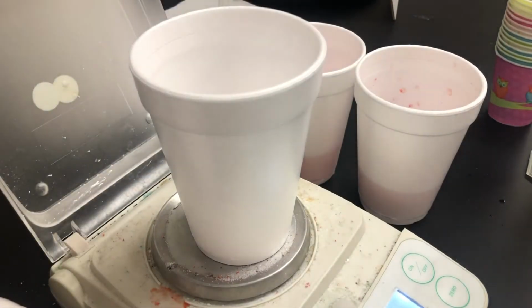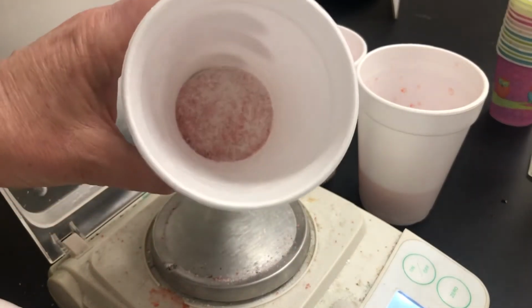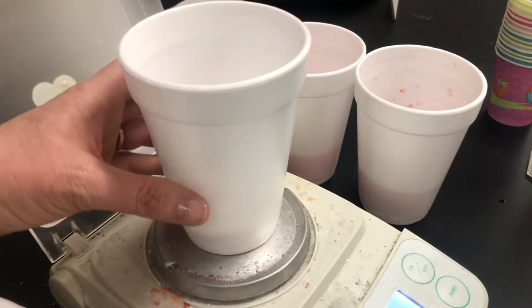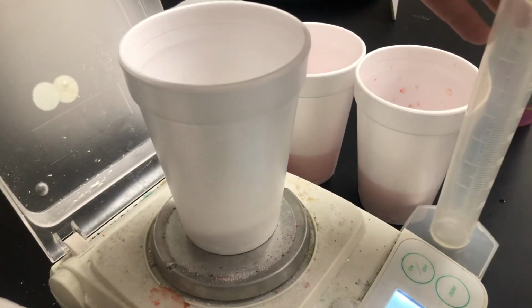All right, perfect. Now look how much is in that cup. That's quite a lot. And so we're gonna put in our 100 milliliters of water.